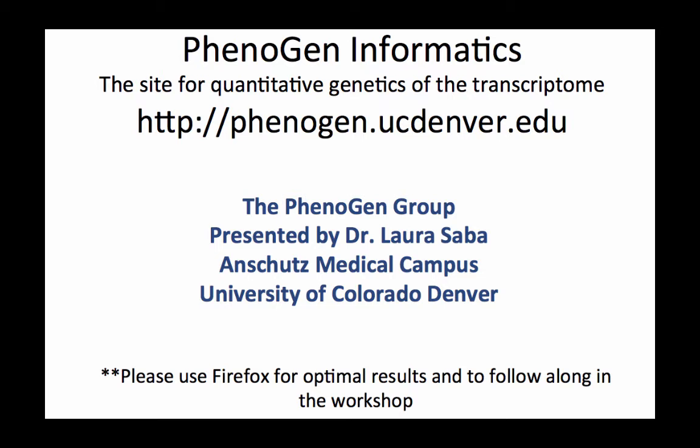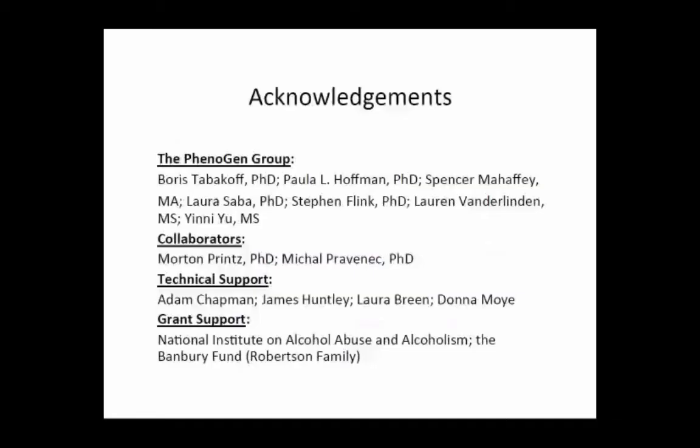I'll give you a little more background on the goals of our project, but first I wanted to introduce a few people. PhenoGen, the website and the data we collect, come from a group of people working together. We have people that extract RNA, people that program the website, and people that do analyses. We've got 3 of them here today, and they're going to help us. As we walk through this, if you run into a problem, raise your hand; I have Spencer, Jenny, and Steve in the back that are going to help us work through those problems.